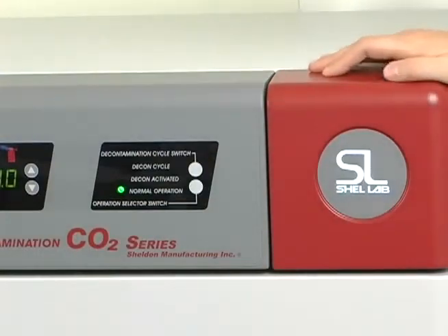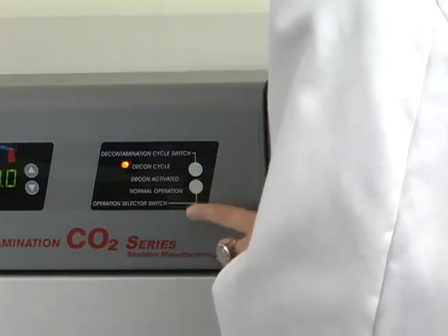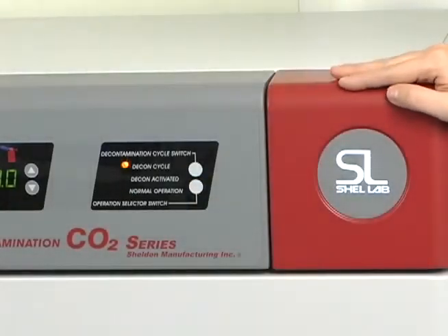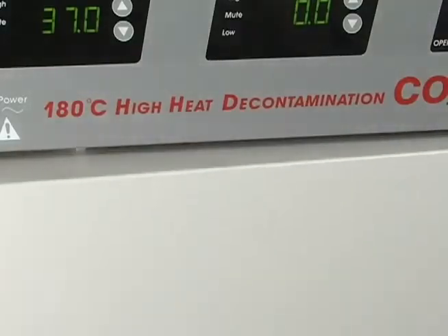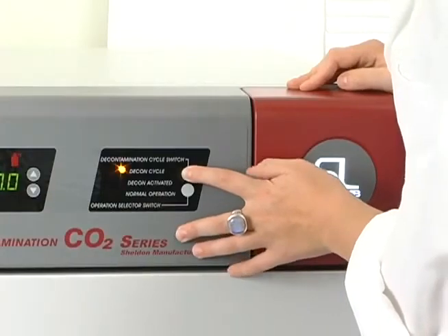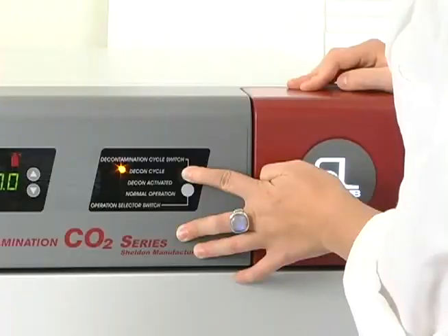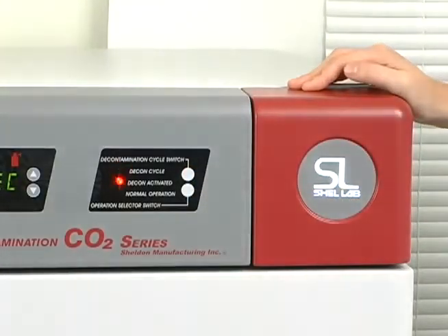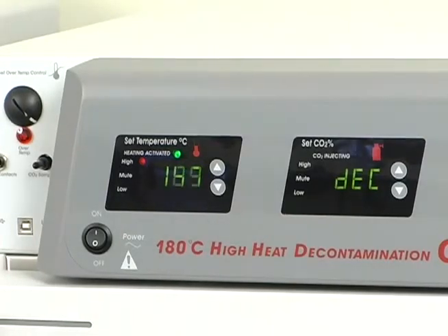To begin the decontamination cycle, press and hold the operation selection switch until the amber decon cycle light begins flashing. You will hear the safety door lock activate to ensure the chamber cannot be opened during the decontamination cycle. Now press and hold the decontamination cycle switch, and both the decon activated and decon cycle lights will alternate while the chamber temperature increases to 180 degrees Celsius. Once at 180 degrees, the light will stay solid and the CO2 display will automatically change from reading DEC to showing a countdown from 120 minutes.